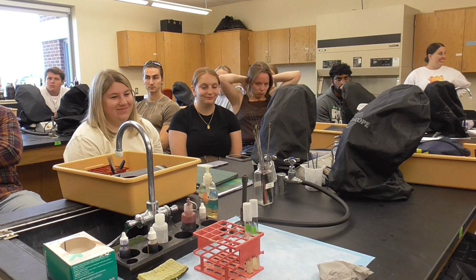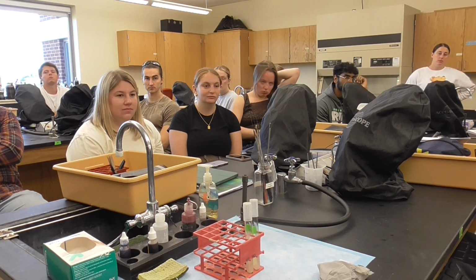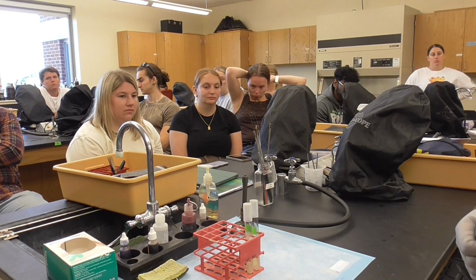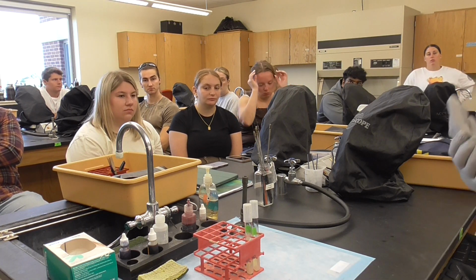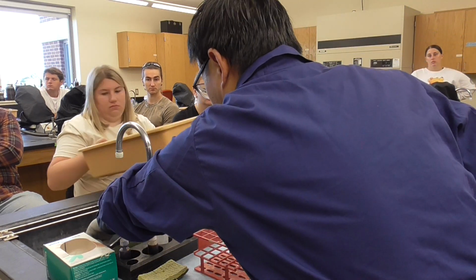So first thing, when you came here early in the morning, not really early, it's still 9:30, 10-ish, clean the bench first. You could grab the microscope because it's going to be used anyway.